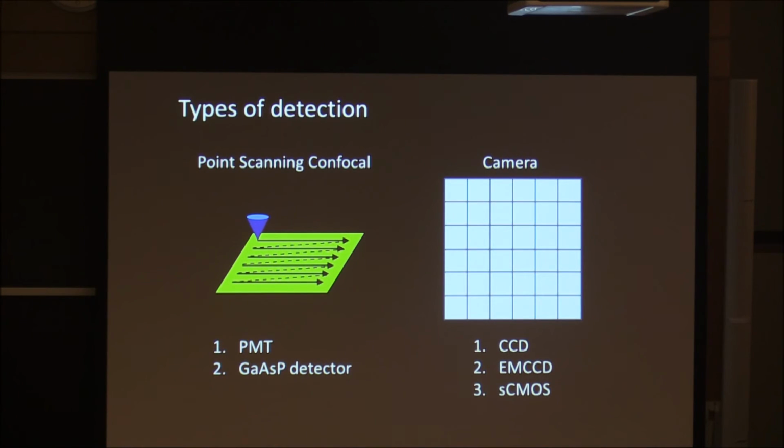Another thing that's very different from microscope to microscope is the type of detection that's used. All of our Widefield systems are using cameras, and the cameras come in different flavors. You can just have a standard CCD camera. You can have a more sensitive EMCCD that might allow you to do lower exposure times, keep your cells a little happier. We have CMOS cameras that can do really fast exposure times that will allow you to get better time resolution in your sample and also shorter exposures.